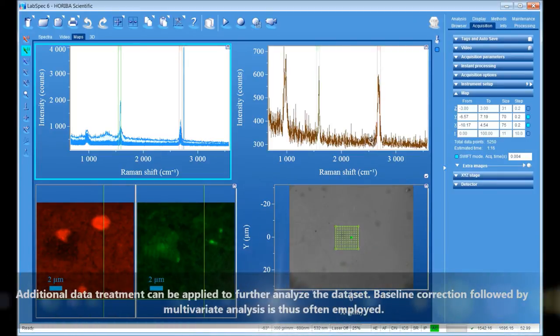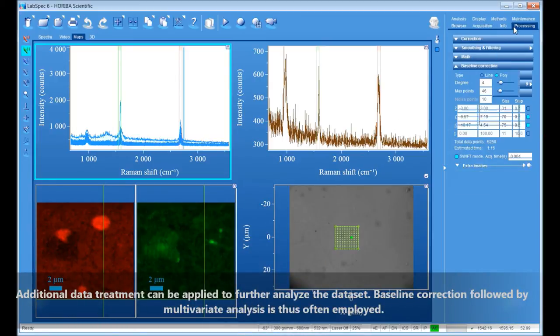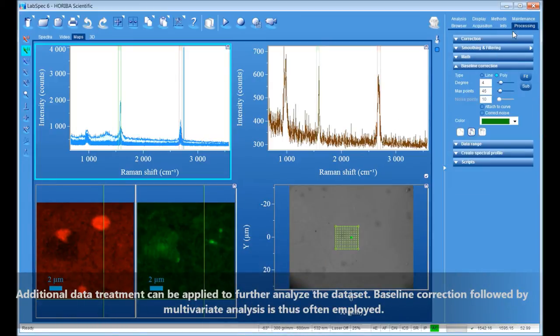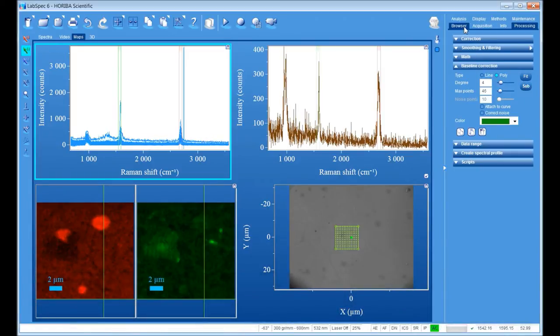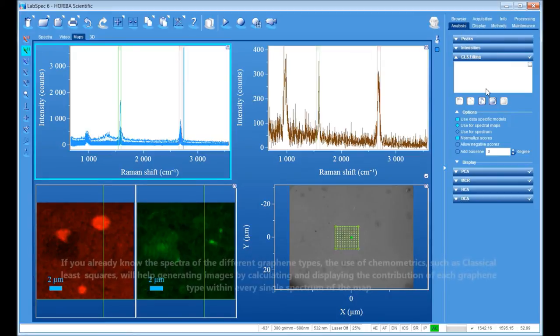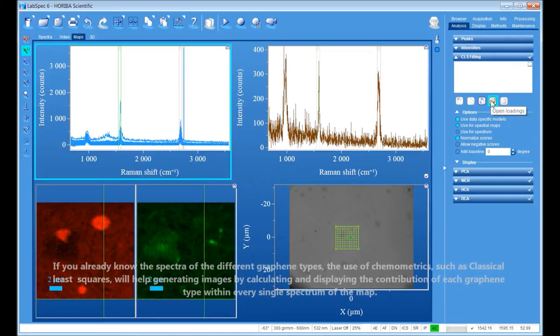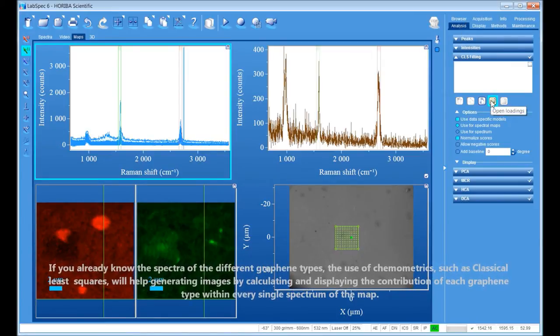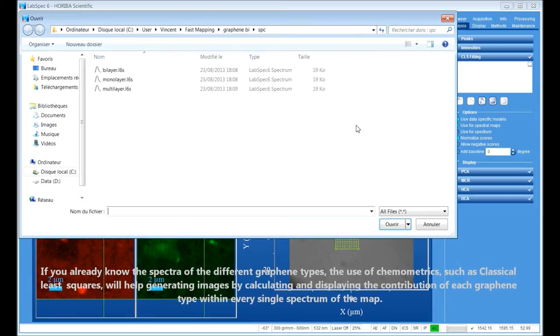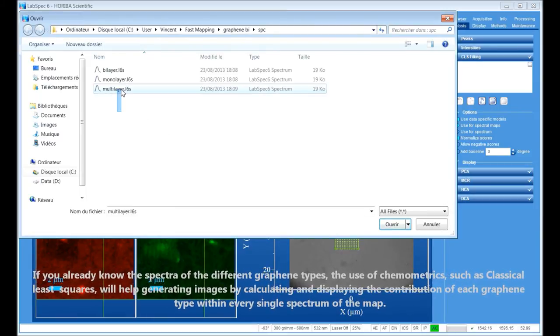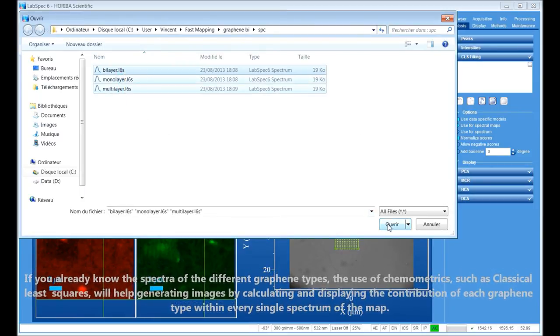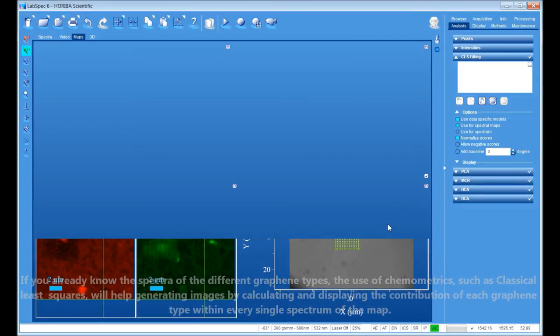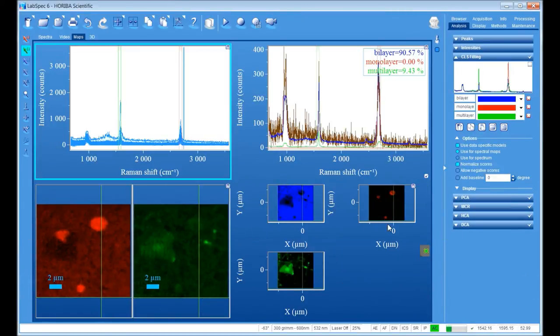Additional data treatment can be applied to further analyze the dataset. Baseline correction followed by multivariate analysis is thus often employed. If you already know the spectra of the different graphene types, the use of chemometrics, such as classical least squares, will help generate images by calculating and displaying the contribution of each graphene type within every single spectrum of the map.